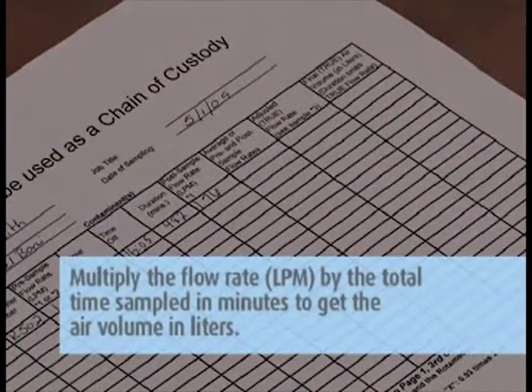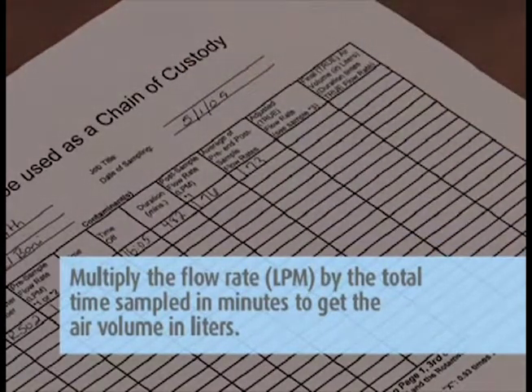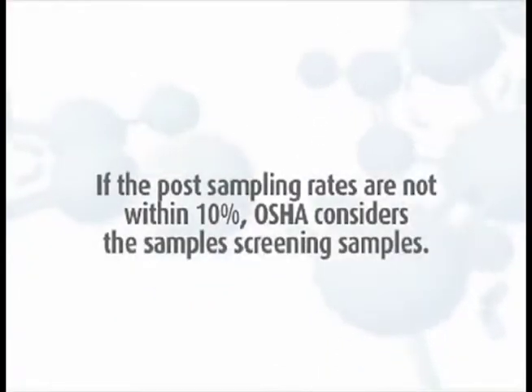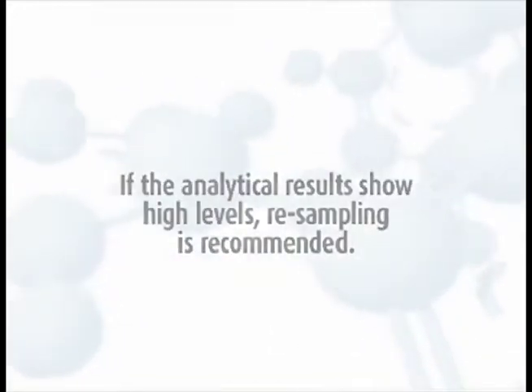Multiply the flow rate in liters per minute by the total time sampled in minutes to get the air volume in liters. Record the total liters on the field pump data sheets and the chain of custody. If the post-sampling rates are not within 10%, OSHA considers the samples screening samples, and if the analytical results show high levels, resampling is recommended.